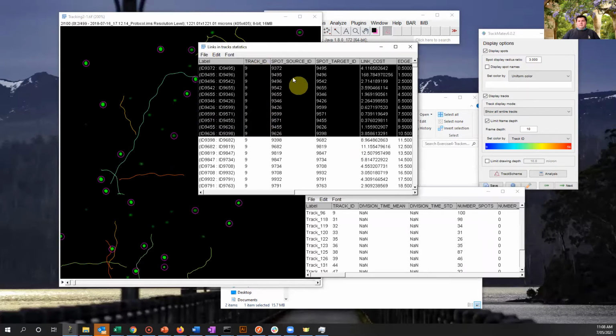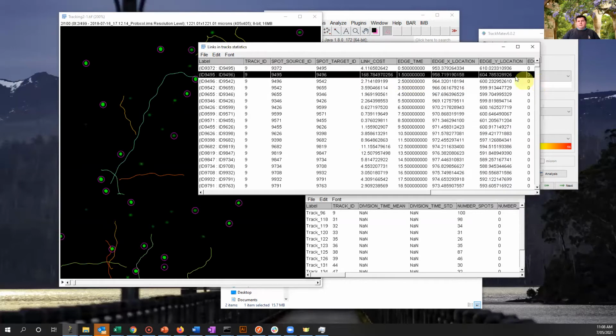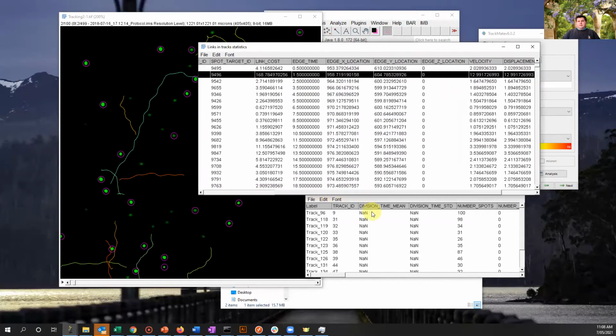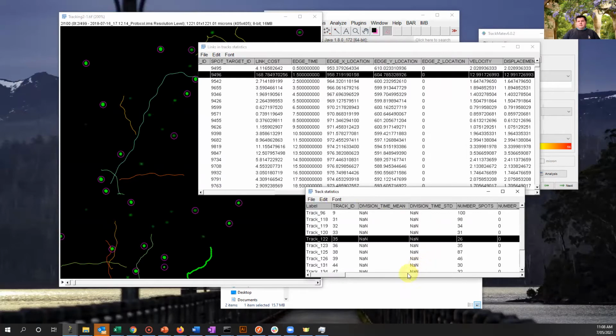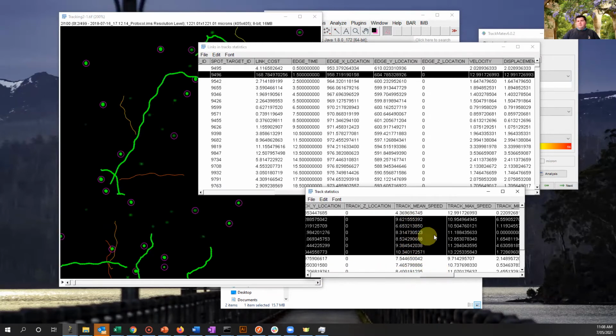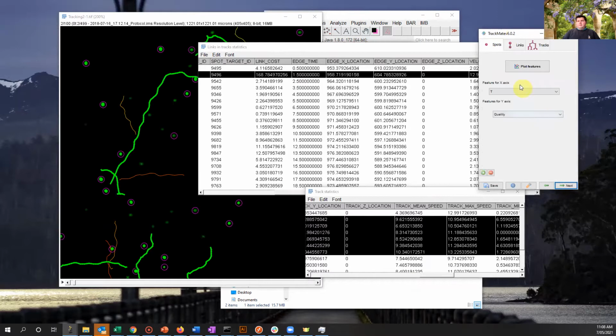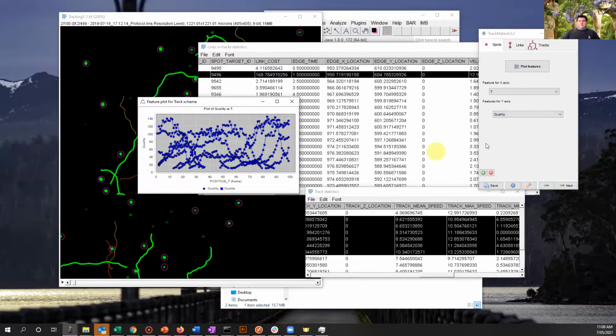So the track ID, what its source, its location. You can see the other kind of things like the number of spots, the number of gaps, all this information, the speed between frames, lots there. And as you select on them, you get different tracks highlighting. So we can modify these and edit them and view the spots and view different plotting tools, so we can see different schemes.